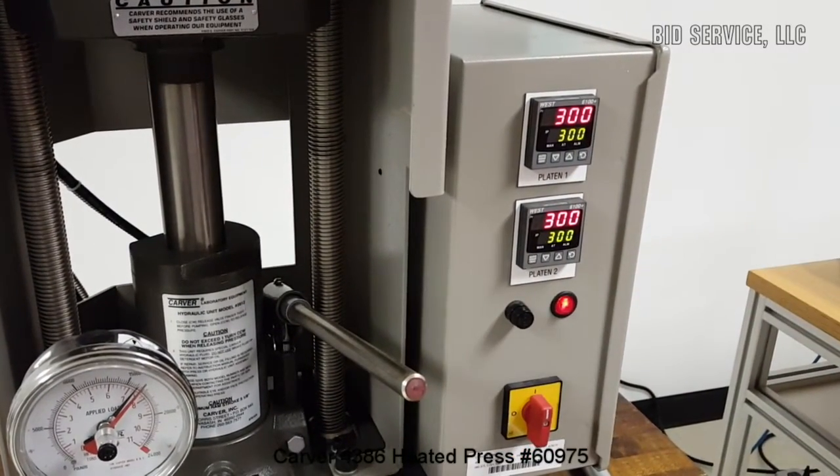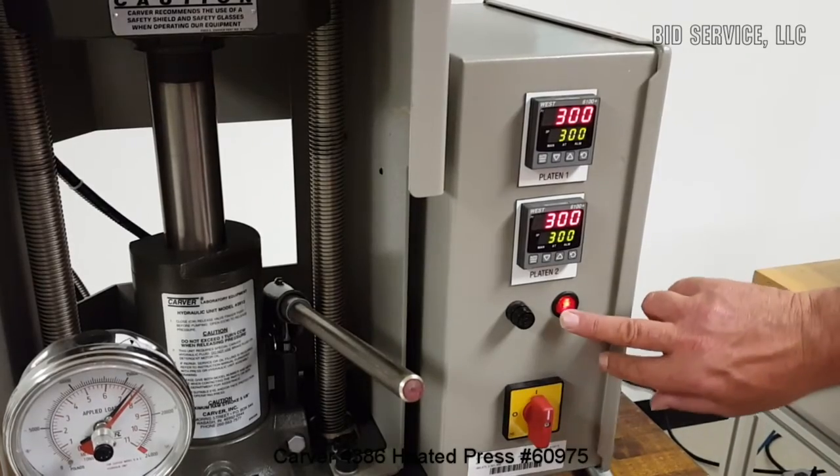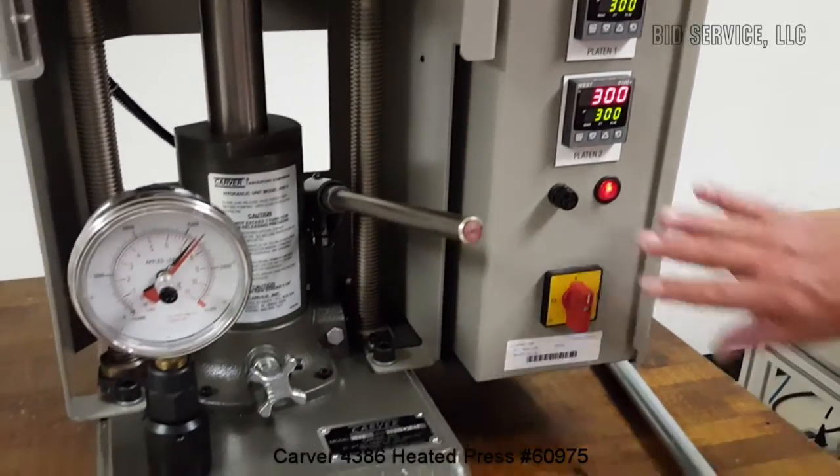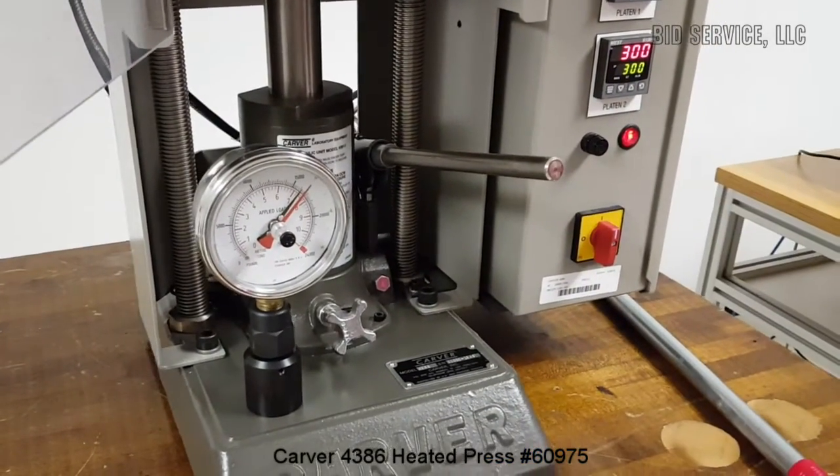You can see it's controlling at that temperature. This is your power switch for the unit; this is the main power. As required by OSHA, there is an emergency cutout.